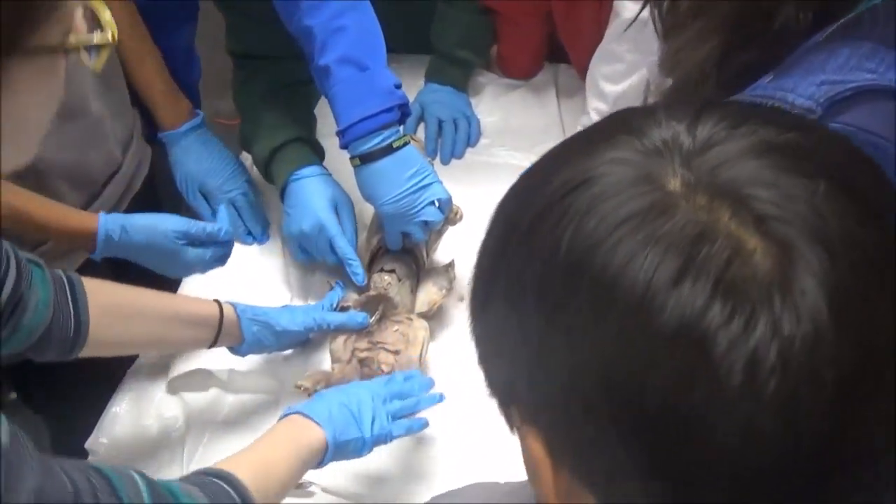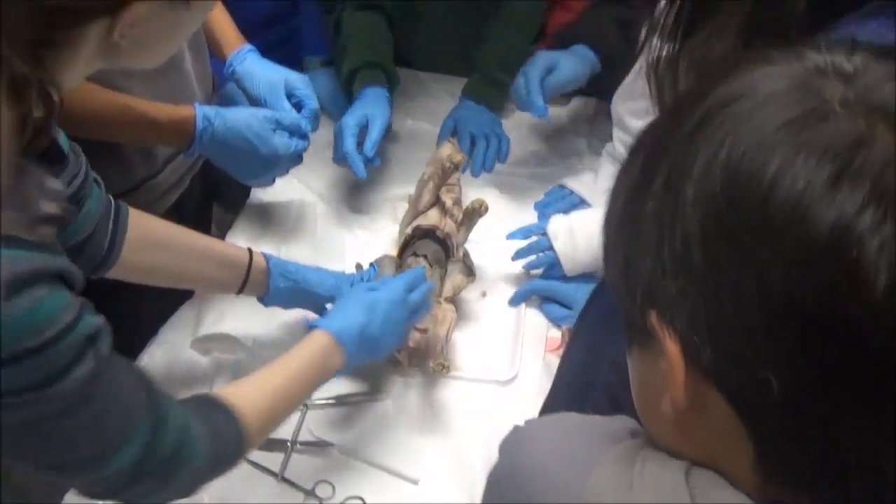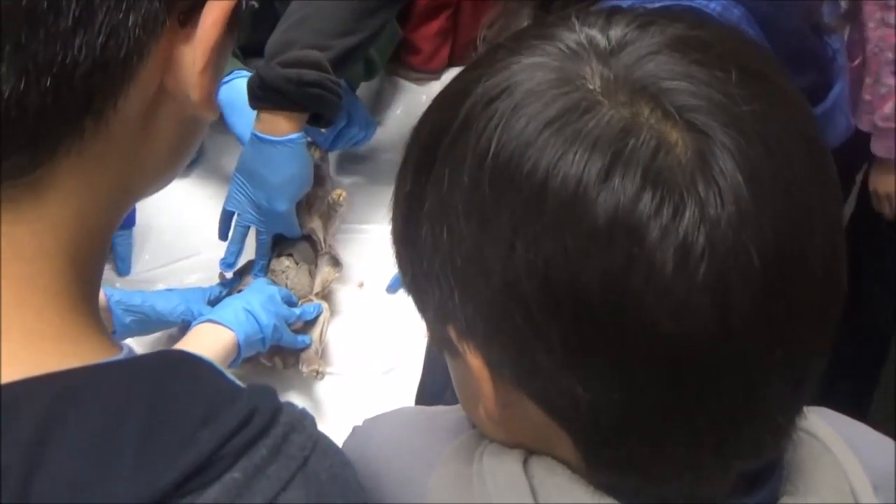Are we going to see the heart too? Not today. Are we going to open up the mouth? We might actually. Oh God!